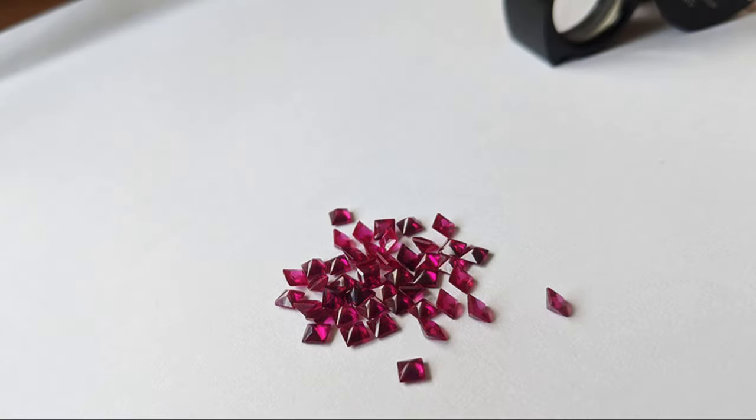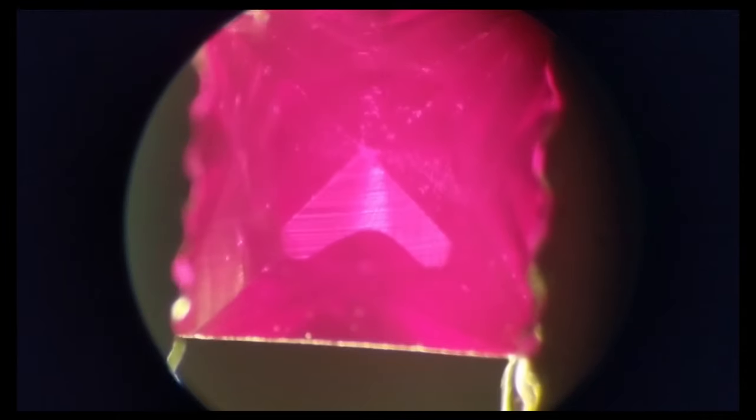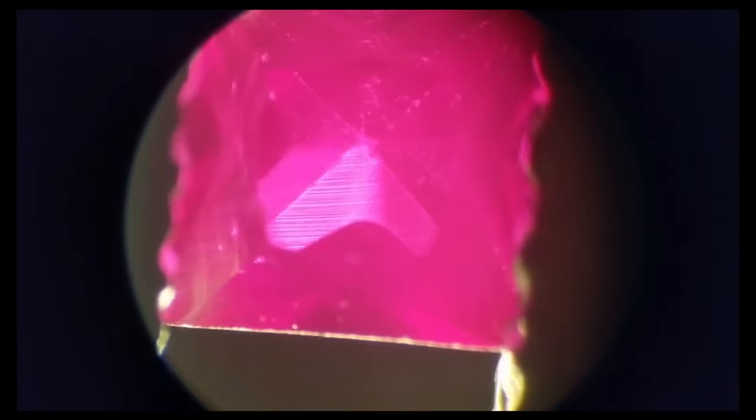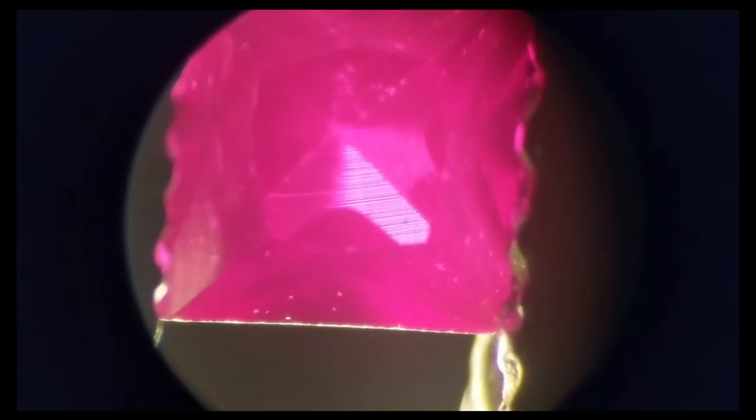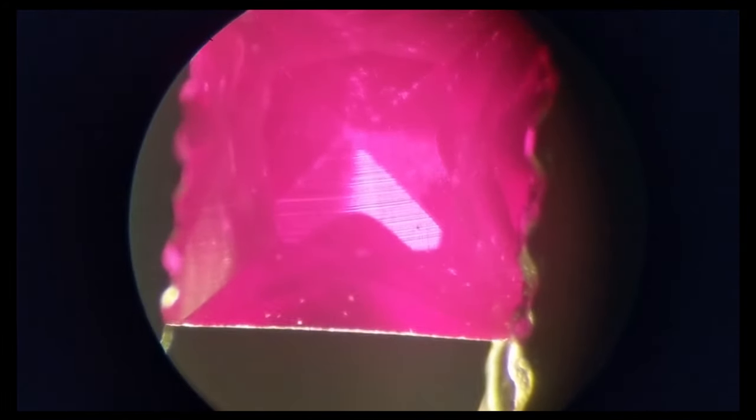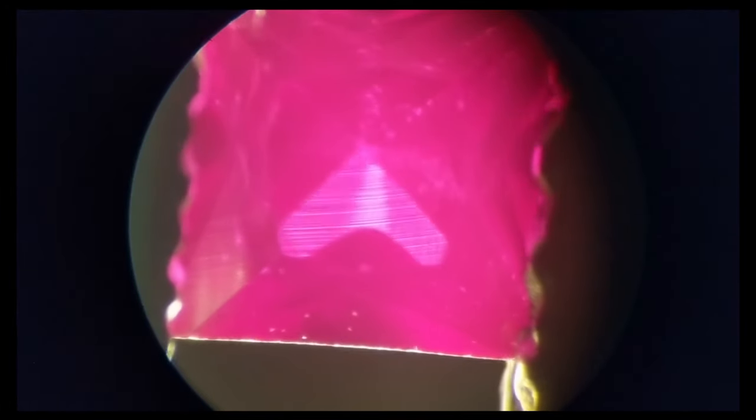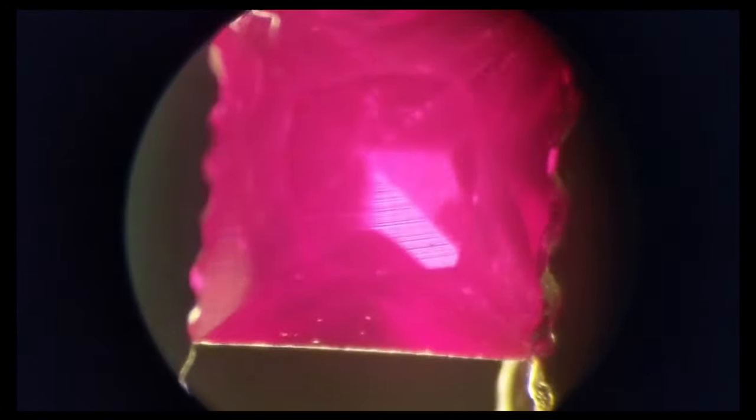Okay so the first microscope video I'm showing you right here is the princess cut synthetic ruby and the first thing you'll notice immediately is these curved lines on the bottom of the stone which I just zoomed in. These curved lines is a clear indicator of a synthetic ruby and they're called curved striae, and it's the most telltale sign for flame fusion ruby.